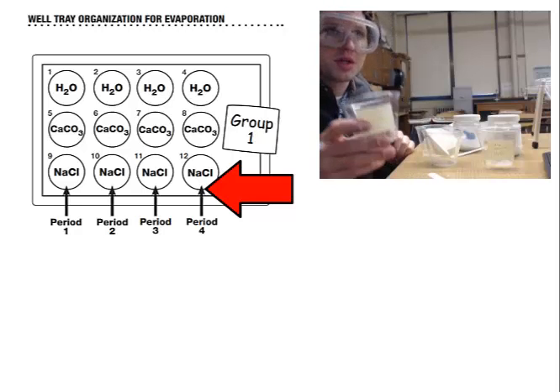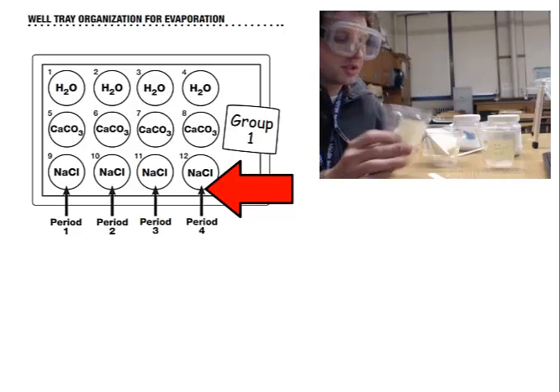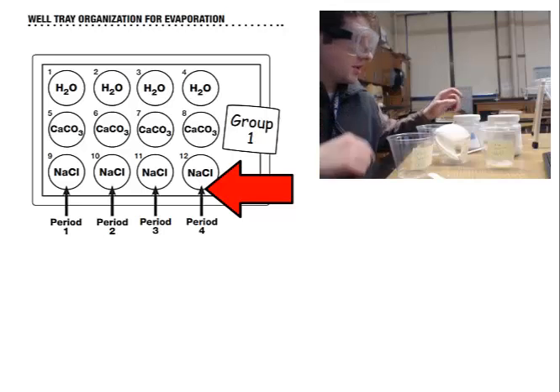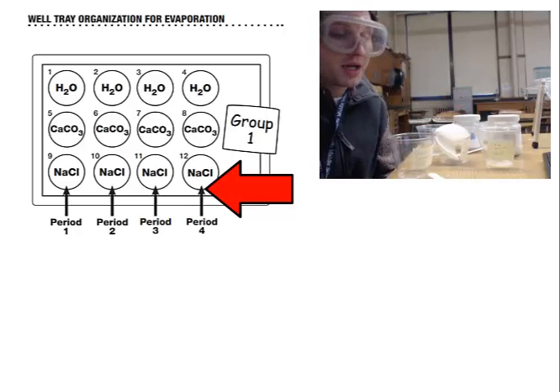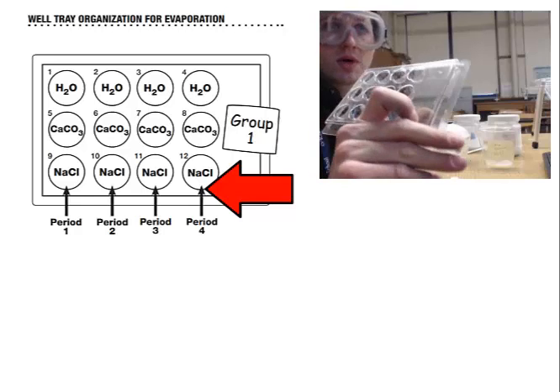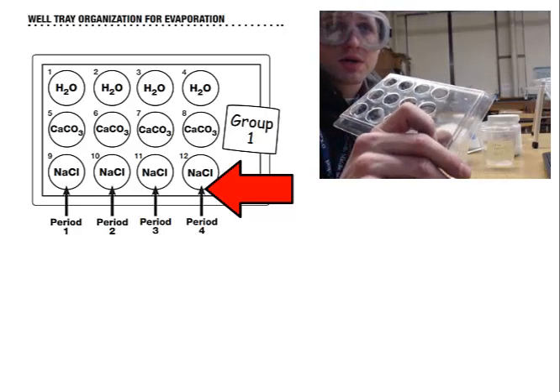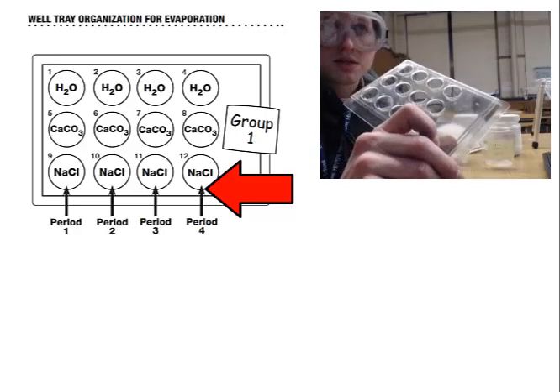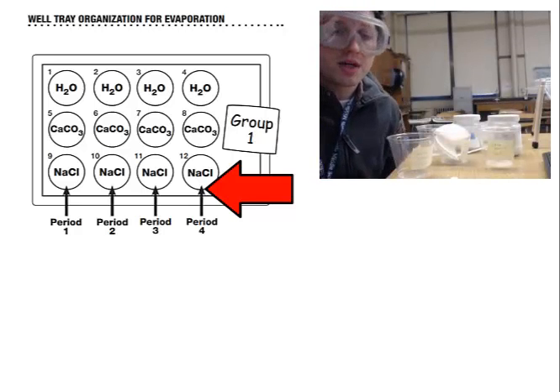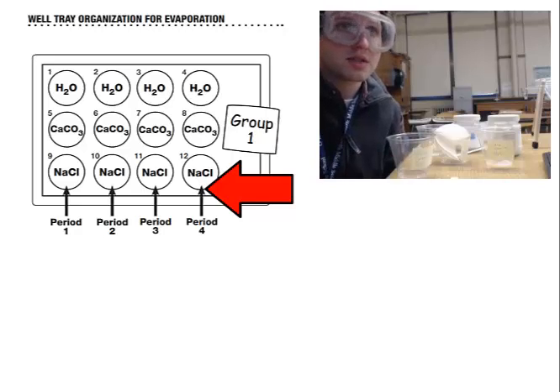It's really important that you clean everything in your lab station. So take off your Post-it notes, put those in the trash. Your filter paper should go in the trash. Clean up your lab station so it's back to the way you found it. The one thing, please leave your well tray. Do not clean out your well tray. We're going to let that evaporate and take a look at it tomorrow. So leave that on your lab bench to evaporate, and we'll just use it for the next class.